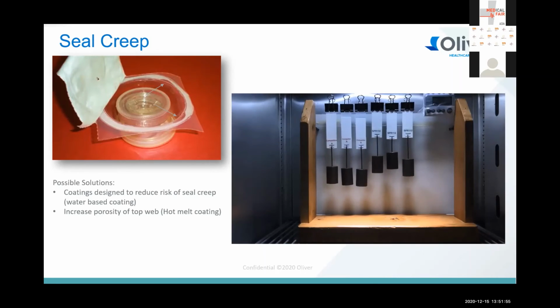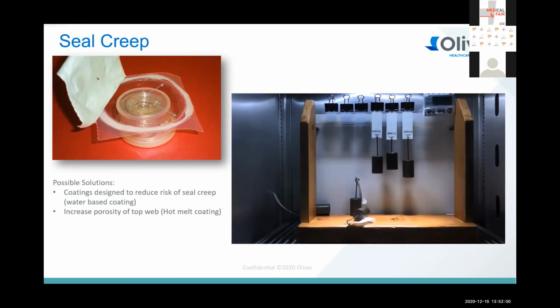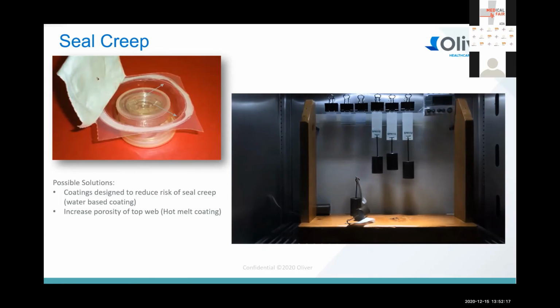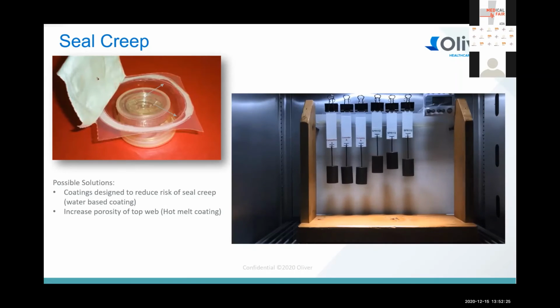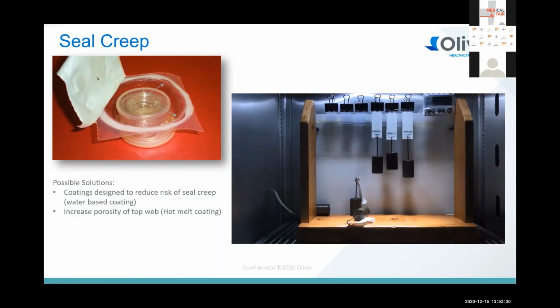The three samples on the left are a weak adhesive. Typically, when we develop a new adhesive, we place the samples in a heated chamber under a 200-gram weight and then stress them under extreme hot conditions, especially 55 degrees, for a stipulated time, typically 24 hours. If it's a weak adhesive, then it will fall down like the three samples on the left. And if it's a strong adhesive suitable for the application, then it will stay intact like the three samples on the right.